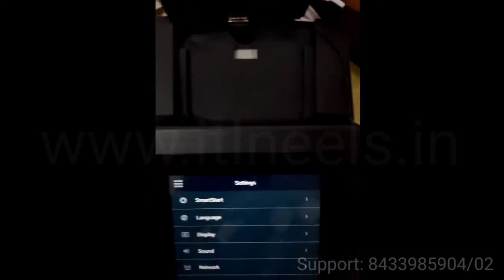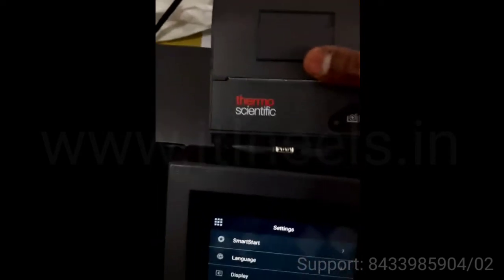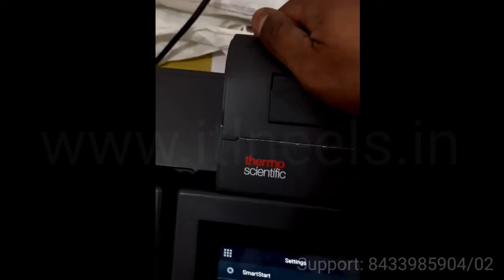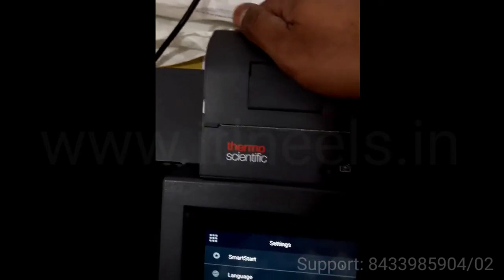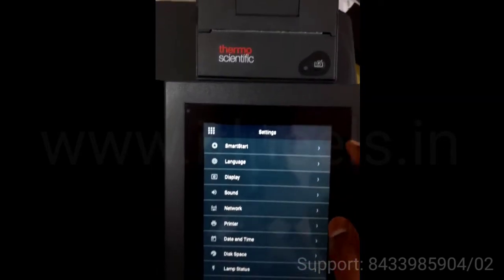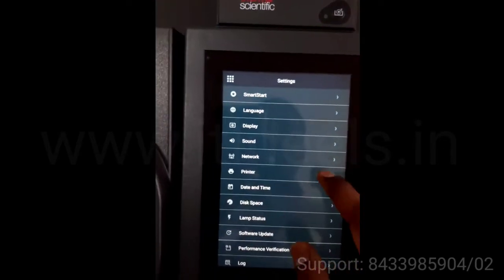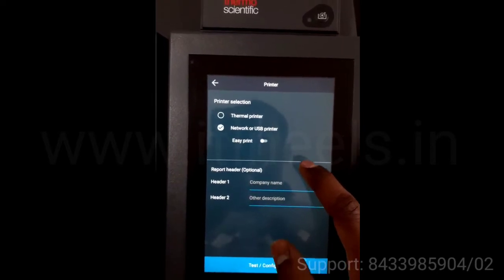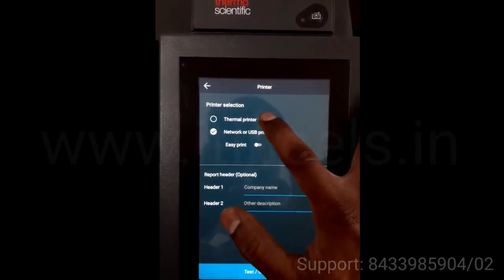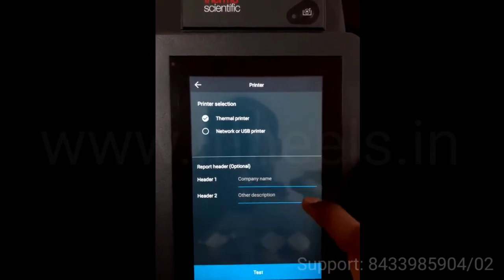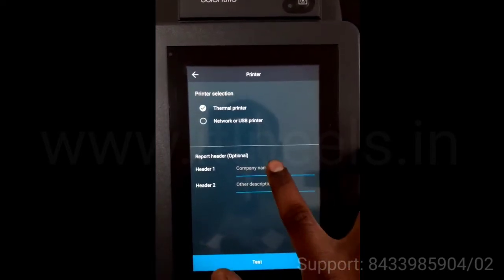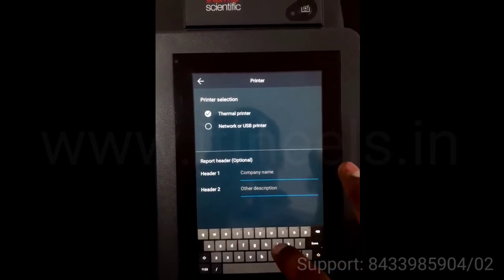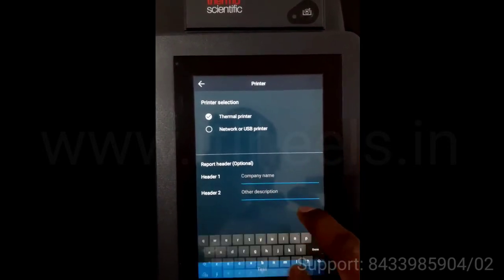Then you have to take the printer and slide it in. This is the thermal printer. You can change the name and settings over here.